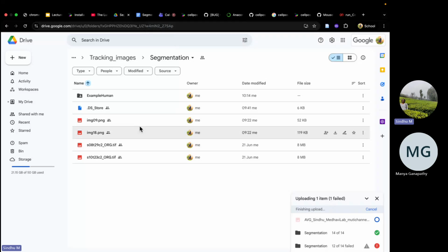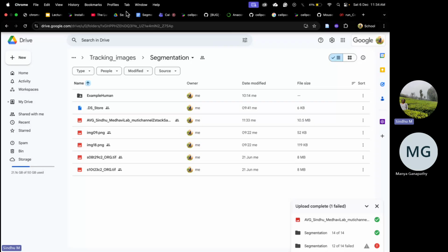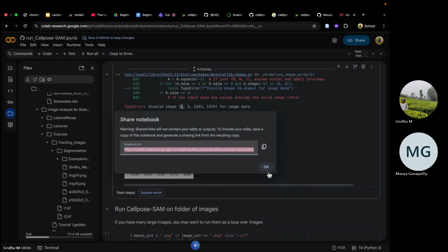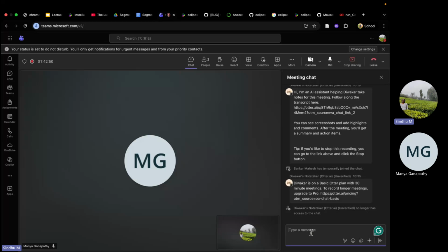You can also try to run it parallelly with me. Okay, so I'm sharing this link. You can make a copy of it and run it on your Google Colab.